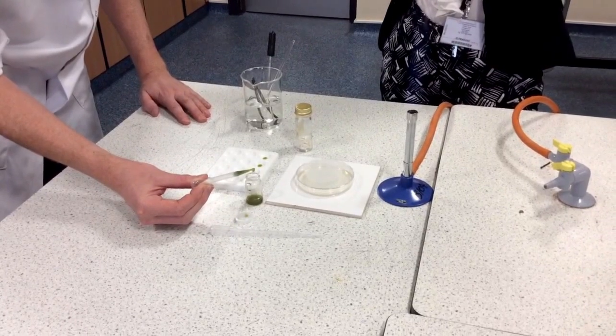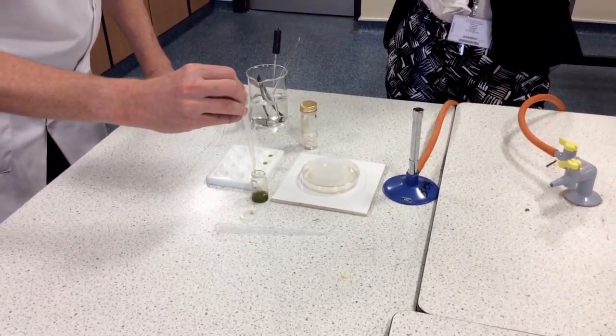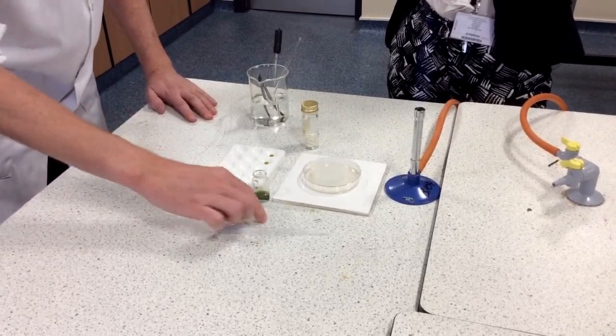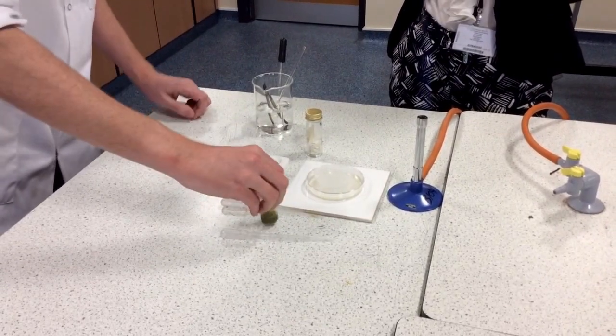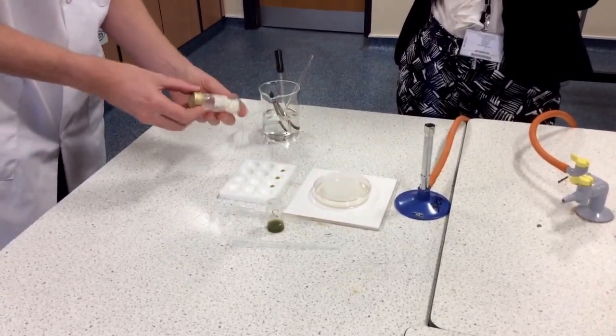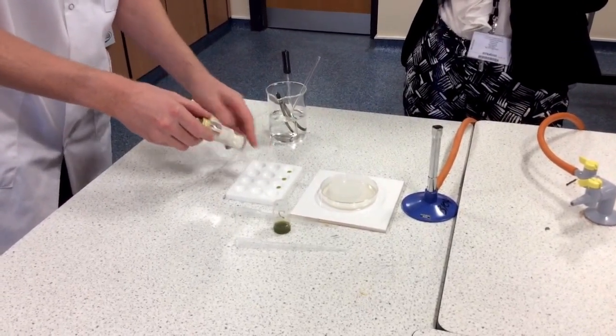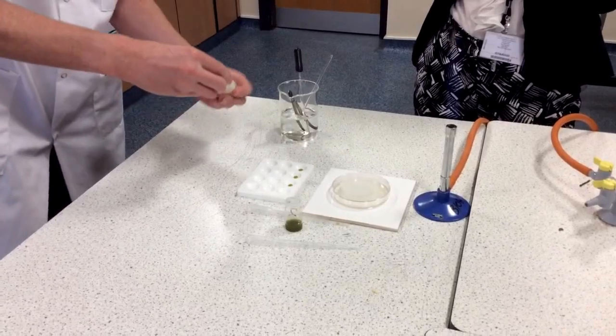Each group will be testing one plant extract, and one group will be testing a medical antibiotic. What I need to do is take one of the paper discs and soak it in the plant extract before placing it into the agar plate.